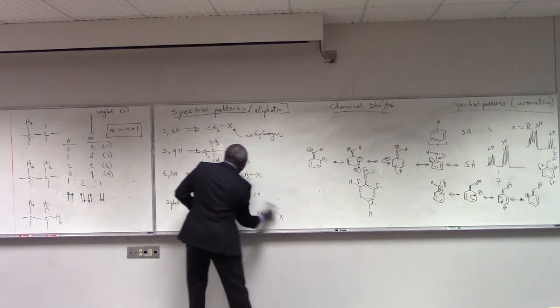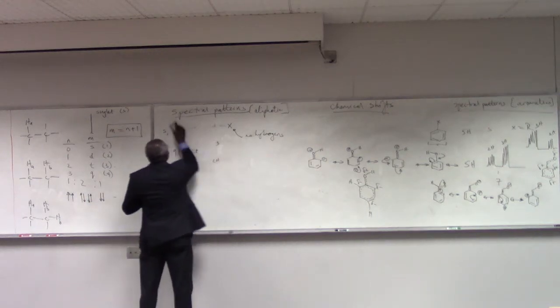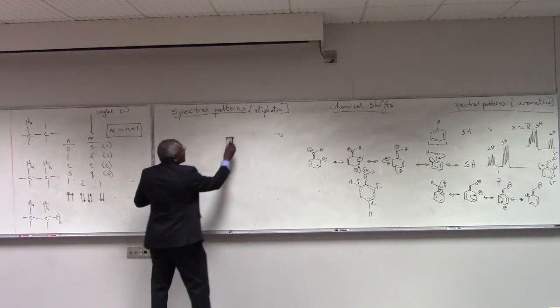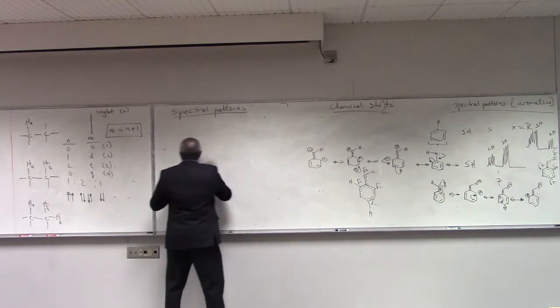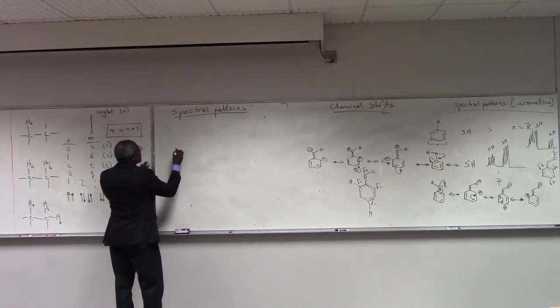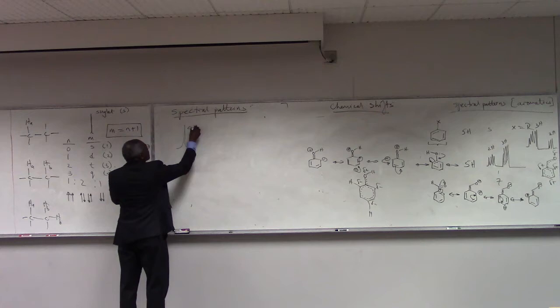The other one that you should be aware of, again under aromatic, would be if you run the NMR and you get a singlet for 4 H's.